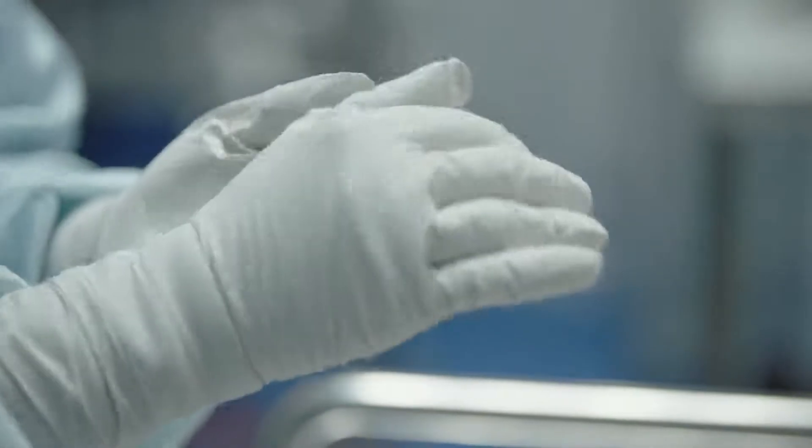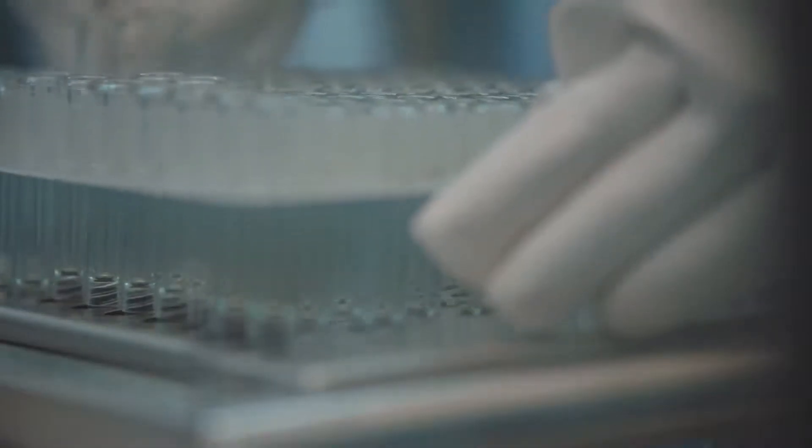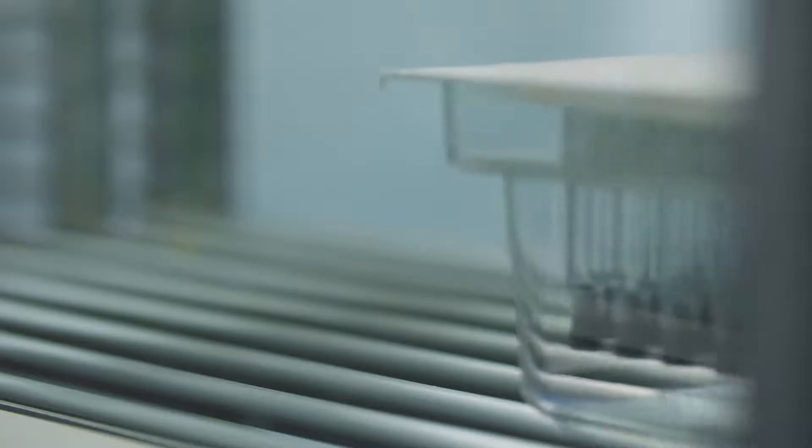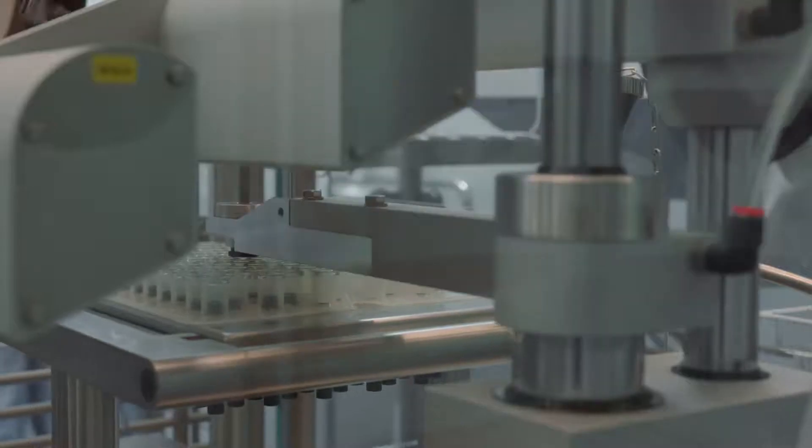In addition to that, they handle very complex formulations, suspensions as well as solutions. The team out there is highly technical, which allows us to take on very complex projects more so than our other facilities.